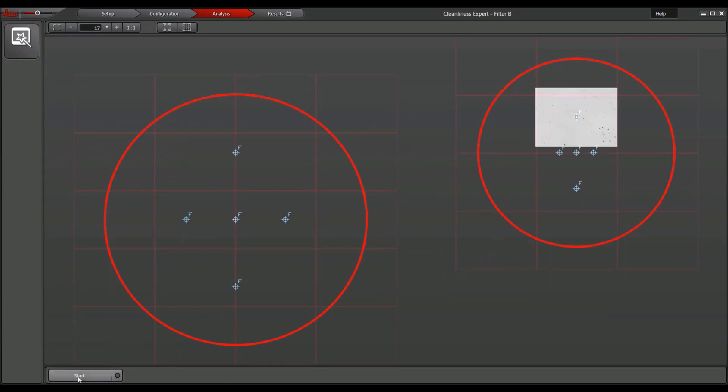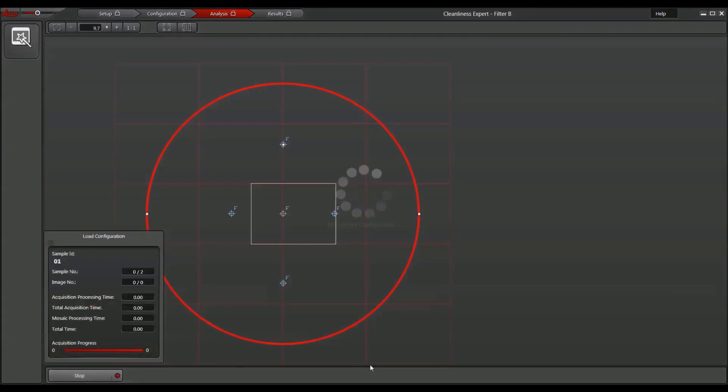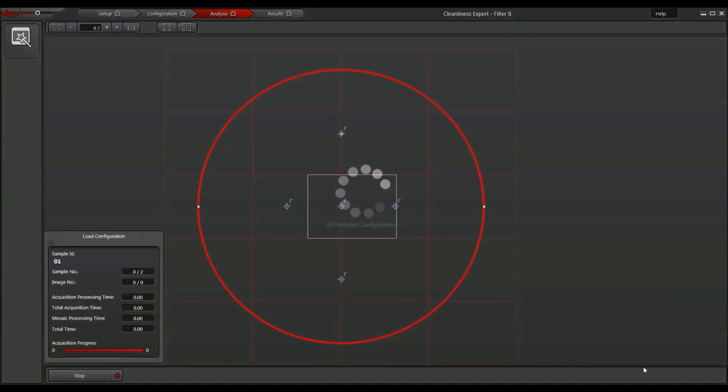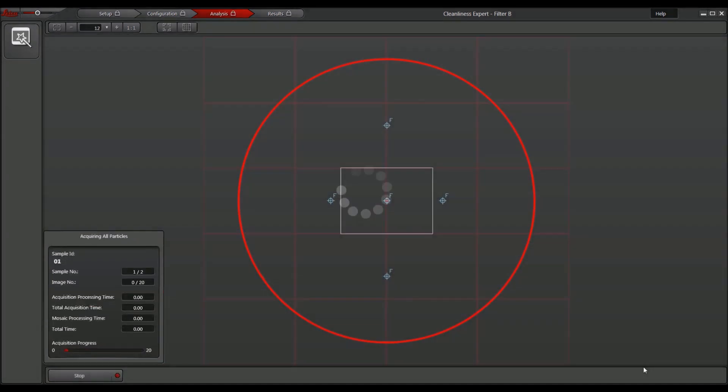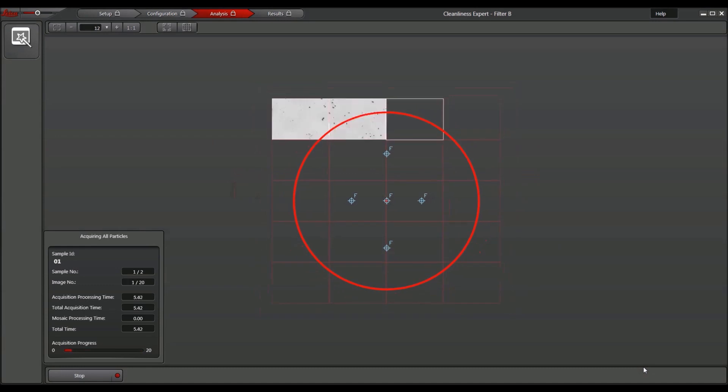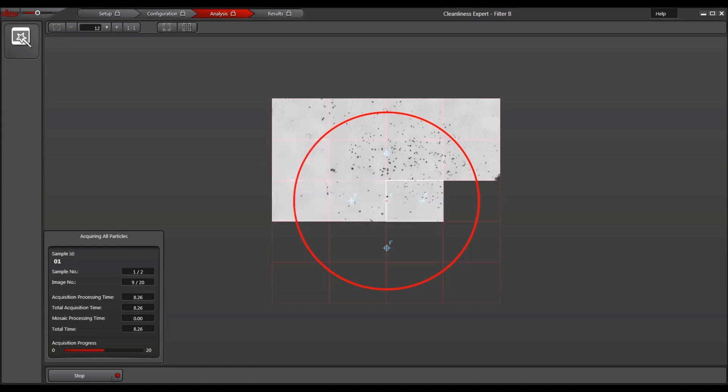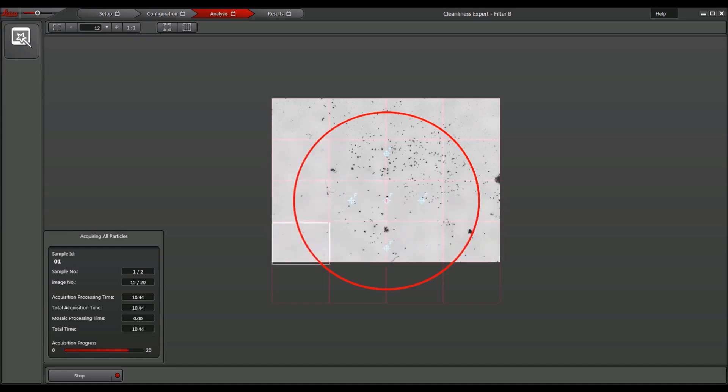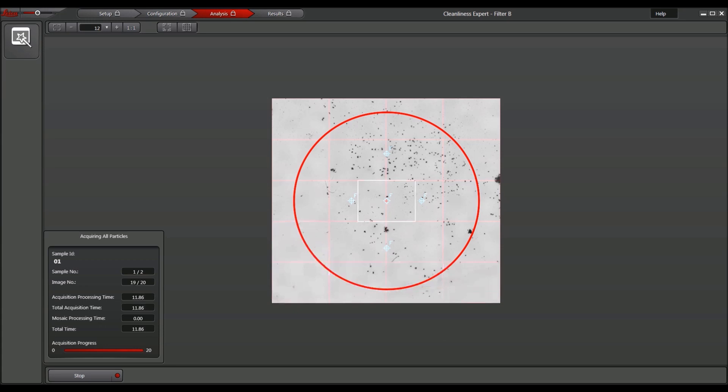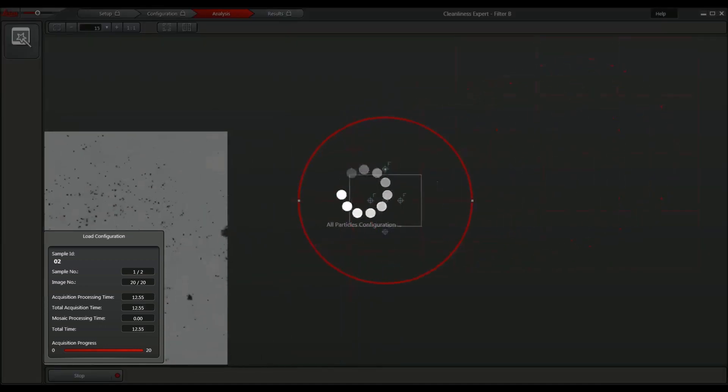Click Start to begin the analysis sequence. The proper configuration settings are loaded and the scan starts. As soon as the first filter sample analysis is finished, the stage moves the next sample into position and applies its predefined settings.